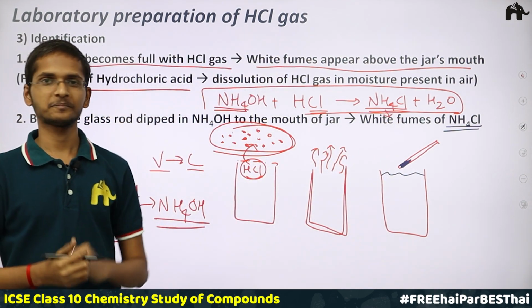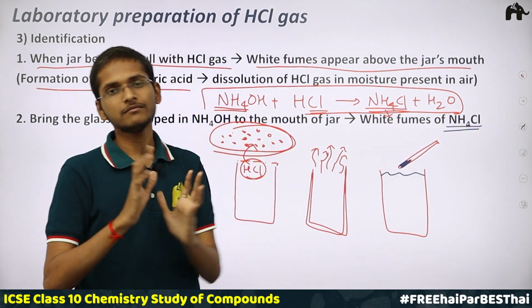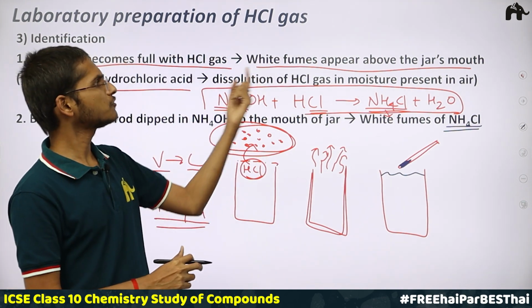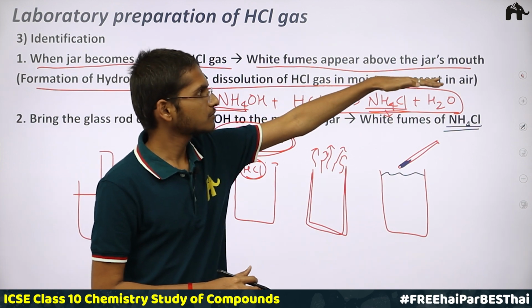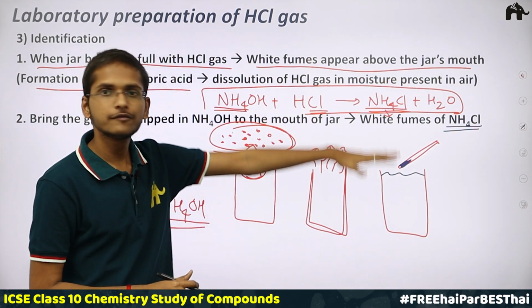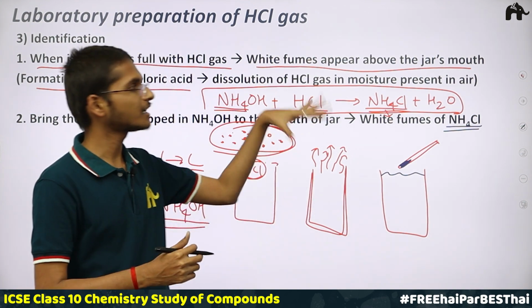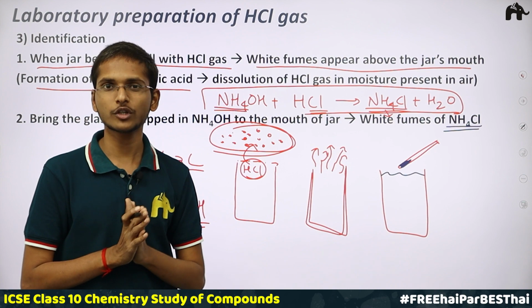Interesting. So once we observe these white fumes, then we can be sure that yes, this is HCl gas. In the same way, once we observe the white fumes at the jar's mouth once the jar is full, we can also be sure that this is HCl gas, because these are the two tests which are used for confirming the presence of HCl gas.